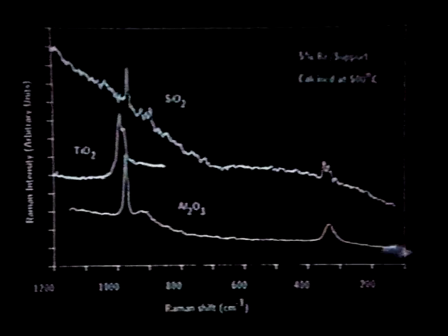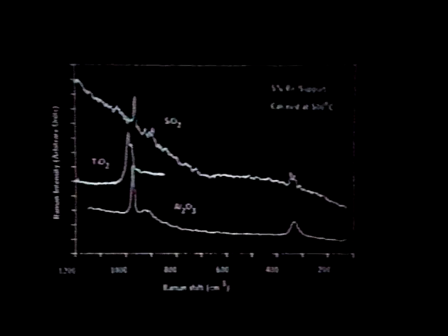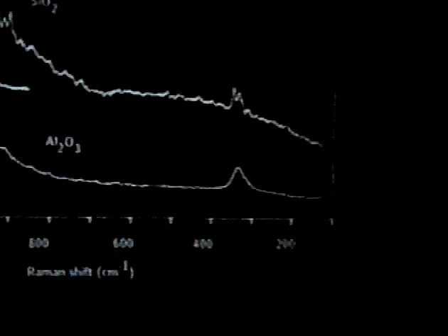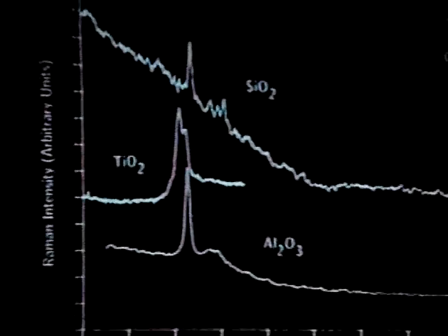Furthermore, the Raman also tells us that there are no bands here at 200 wave numbers. The presence of a band at 200 wave numbers tells us that we have bridging oxygens, that the rhenium are attached through rhenium-oxygen-rhenium. So we don't have a band here, and that tells us that the ReO4 units on aluminum are isolated. So they're monomers, and nothing more.